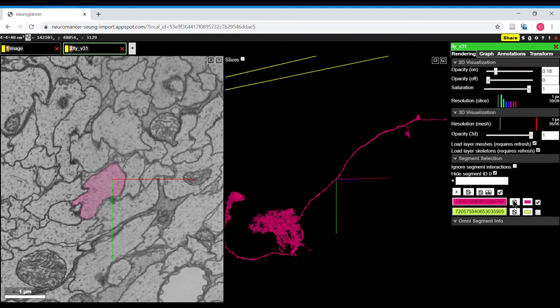I'll talk more in another video about how to use annotations and how to edit neurons by splitting and merging.